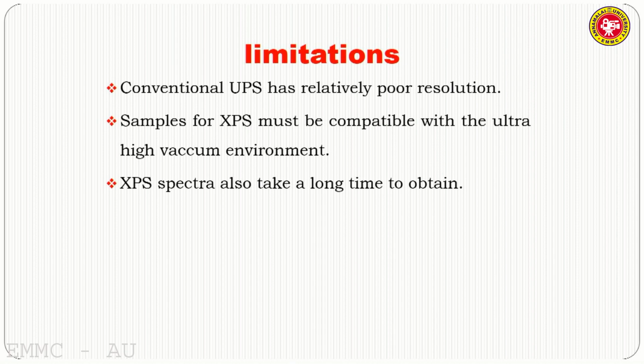General limitations: conventional UPS has relatively poor resolution. Samples for XPS must be compatible with the ultra high vacuum environment. Pure samples are required here. XPS spectra also take a long time to obtain.